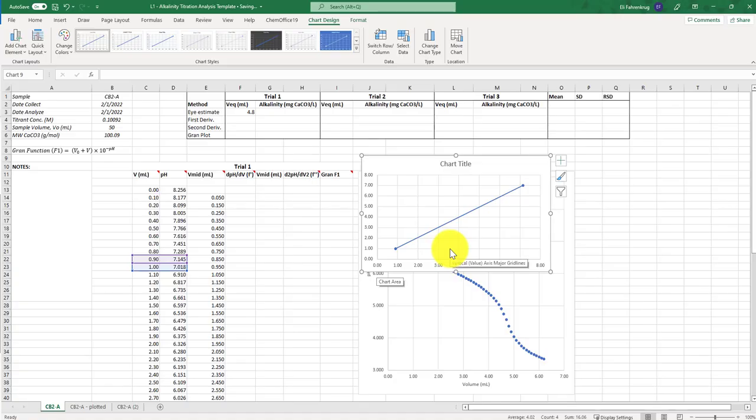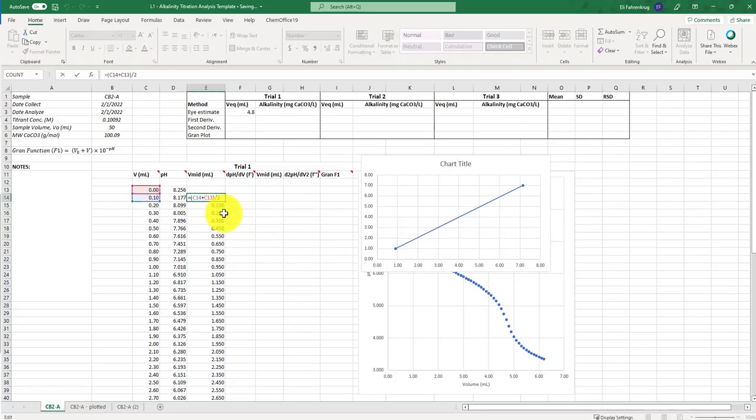That's what we're doing in a spreadsheet computation of the derivative. And so when we replot the derivative curve, that dpH dV, that exact slope, is really the slope somewhere in the midpoint of this line, not at each of these individual points, because the line may change after that. And so when we're doing this by an Excel spreadsheet method, what we want to do before we compute the change in pH over change in volume is actually find the midpoint of these 2 volume points at every single volume change. And so that's what I have as this third column, Vmid, is the midpoint volume. And that's just simply calculated, if you look at this formula, as the addition of those 2 points divided by 2, which is really just telling you that's halfway between those 2 points. So that's this point between every set of points, because that's a more accurate representation of the volume at the slope that we're going to compute.